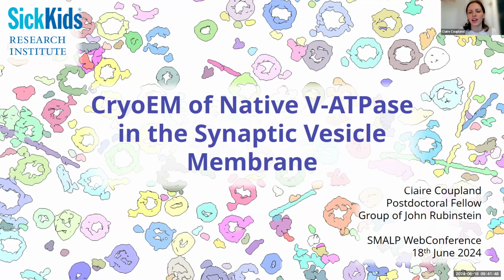As Rakesh said, I'm going to be talking today about the work that I've been doing as part of my postdoctoral research fellowship here at the Hospital of Sick Kids in Toronto. And this work focuses on studying the structure of the V-ATPase within the native synaptic vesicle membrane.